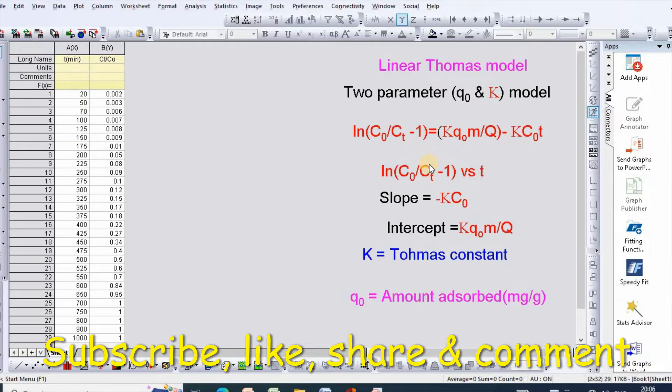Therefore, in this video, I would like to show you how to fit linear Thomas model using Origin Pro.